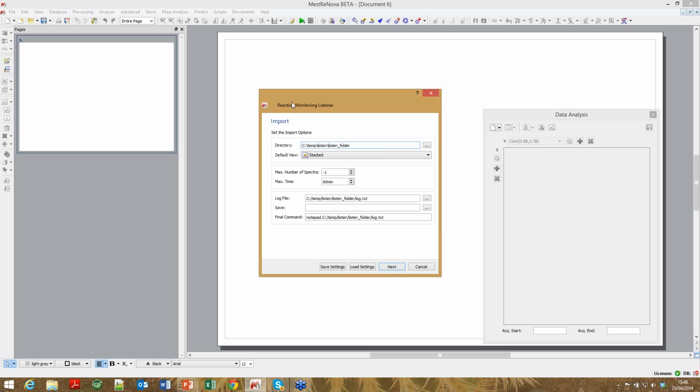So let's say you have a reaction vessel and you want to monitor the production of products, and you want to quench the reaction as soon as the product is formed completely, because if you don't, then it starts to go off, for example. Or you want to monitor the concentration of a particular impurity, and you know that can't get higher than a certain level. Then this is the way you do it.